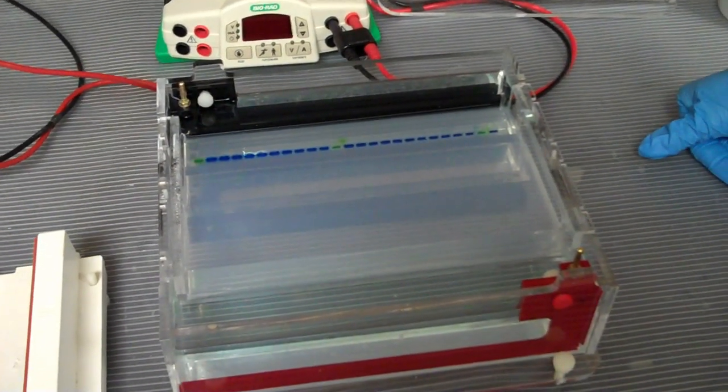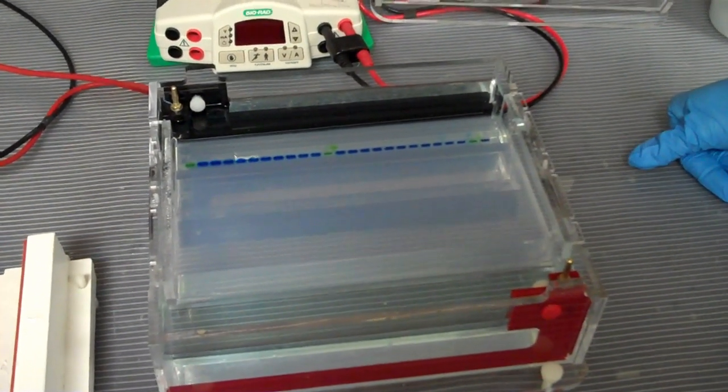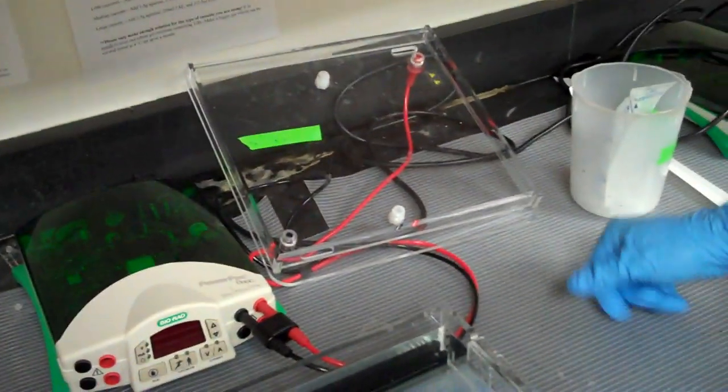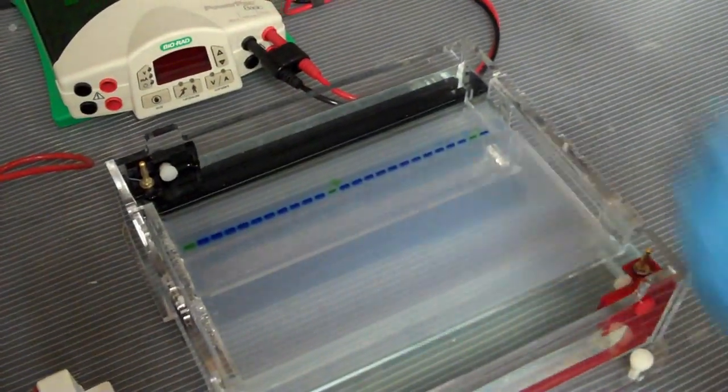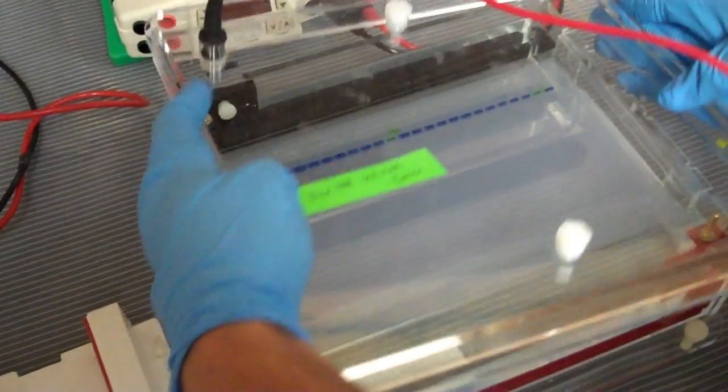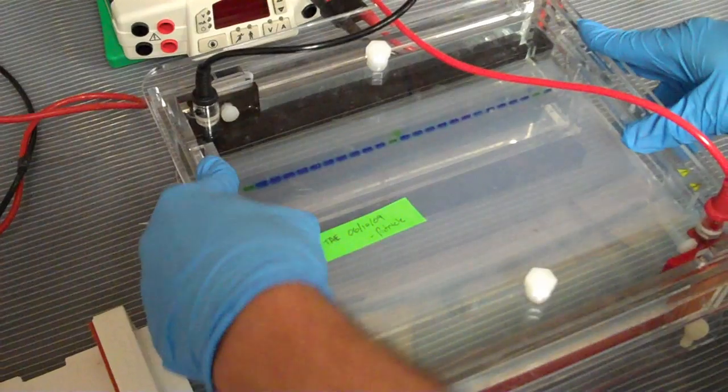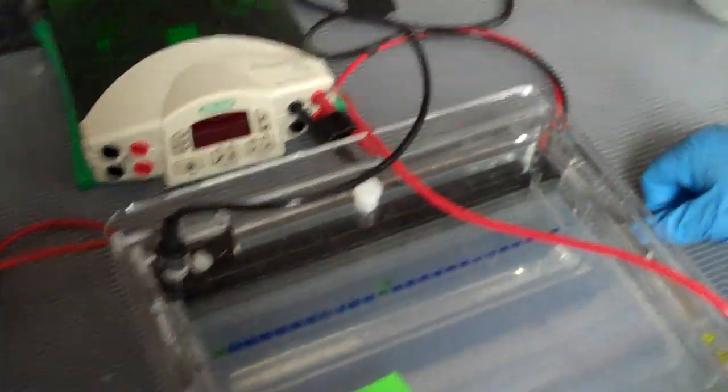Put the lid on top of the machine. Make sure the lid is plugged into the green Bio-Rad machine and turn it on.